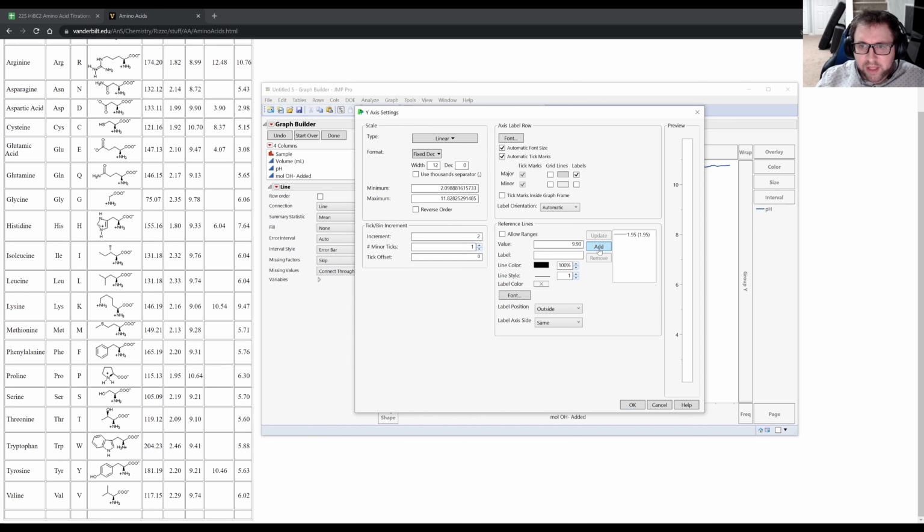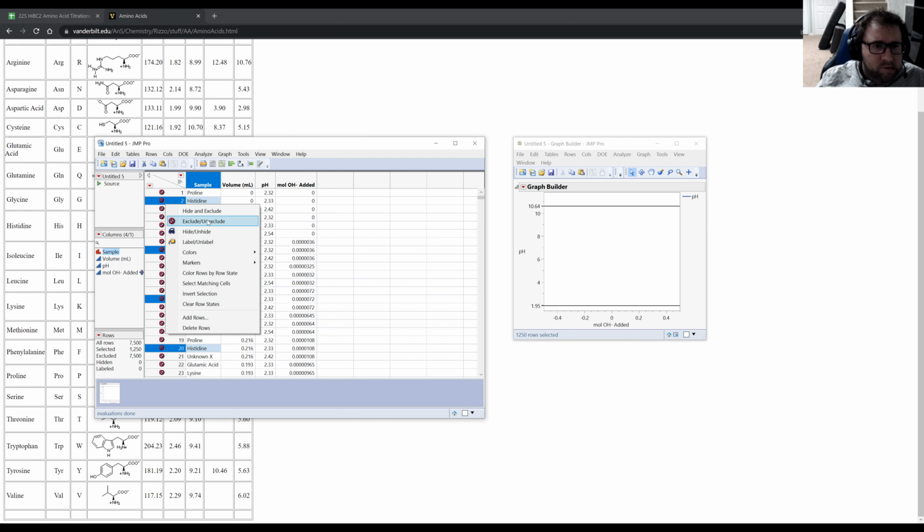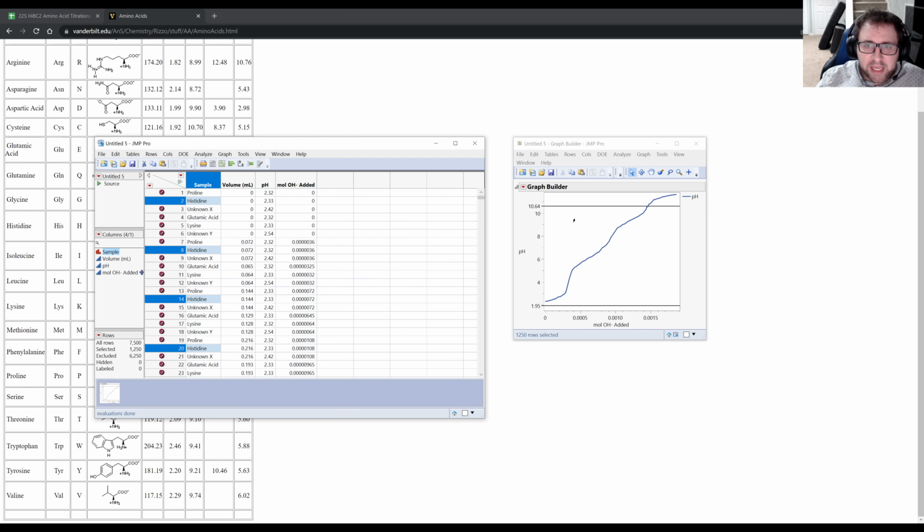So we're going to go back to here and do our next one. So we're going to select all of the proline. We're going to exclude them all. And then maybe we'll do histidine next. So we'll unexclude that. Bam, that pops up.